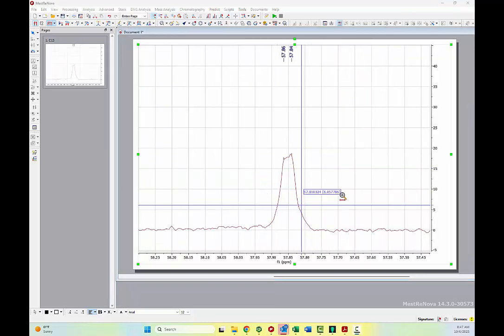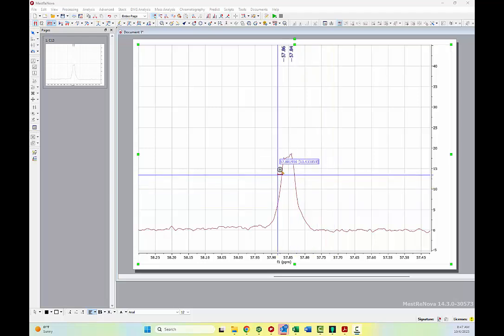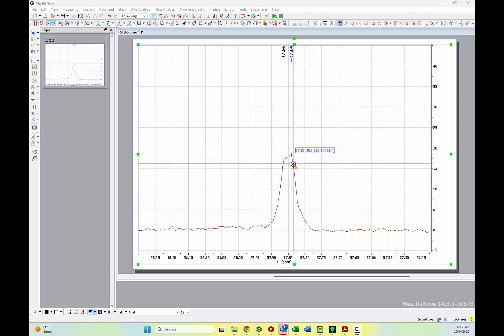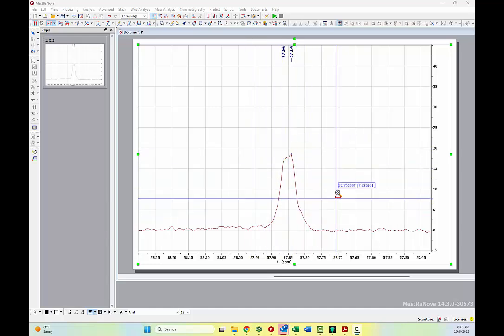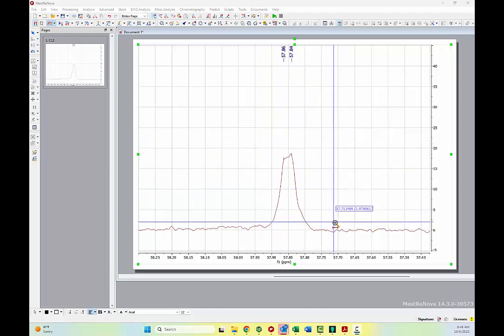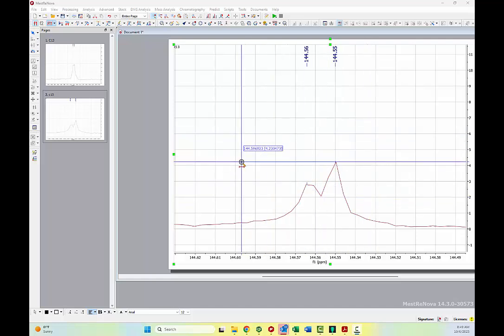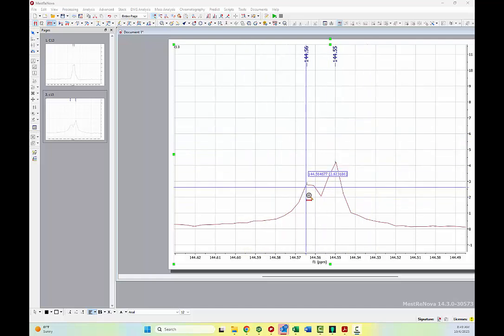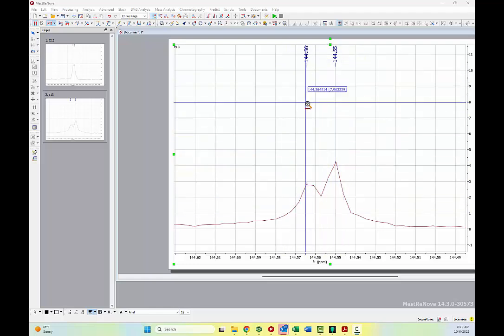If you take a closer look at the peak at 57.9, you can see why the computer might call this two different peaks, because there's a higher point over here and then a higher point over there. But even to relatively untrained eyes, this just looks like a singlet, and you're pretty comfortable calling it a singlet. However, and this is a separate spectrum, you can sometimes encounter scenarios like this one where it really does appear to be two different lines right next to each other. Except that you should be aware that though that's possible, it's pretty unlikely.